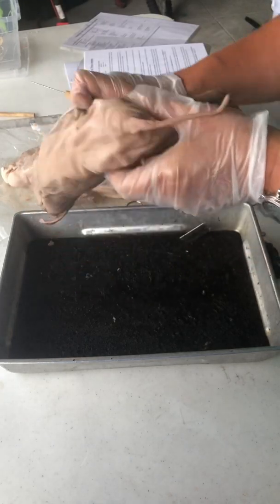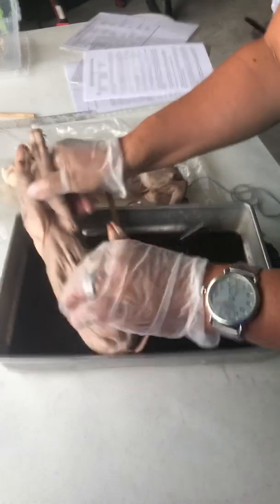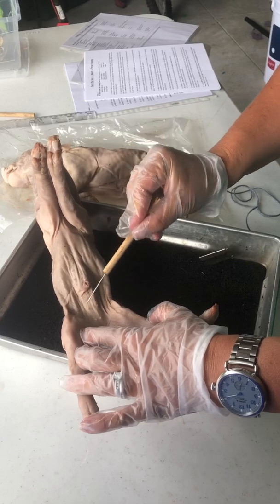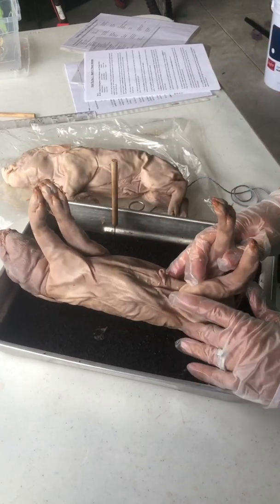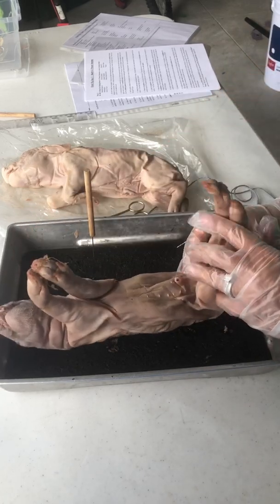And then you're going to study the ventral surface of the pig and note the tiny bumps, which are right here. All these tiny bumps right here, which are the mammary papillae. These are present on both sexes. In the females, these structures connect to the mammary glands, which produce milk.